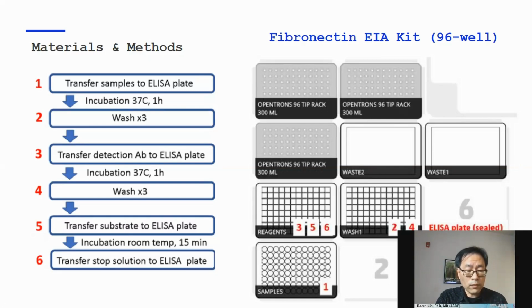And wash the plate 3 times. Add substrate solution, incubate 15 minutes at room temperature, and then add stop solution before taking the plate to a plate reader.